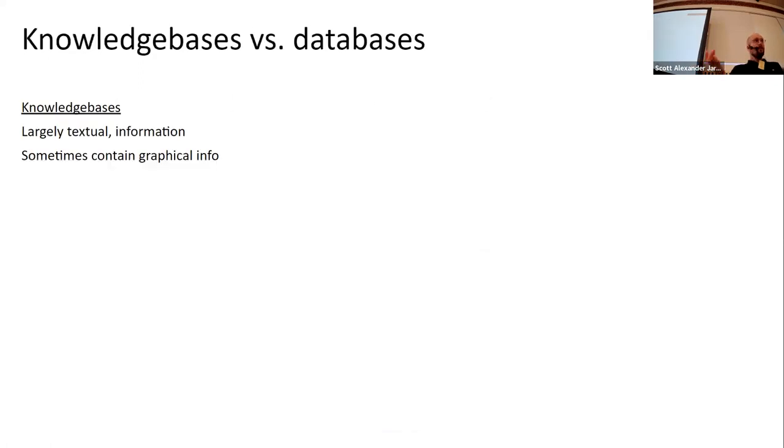So what Justin touched on a little yesterday, in order to annotate any of our data, we need databases.